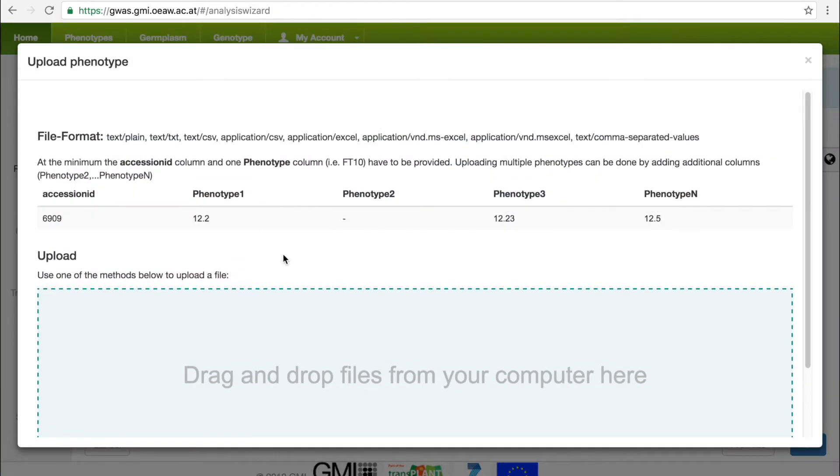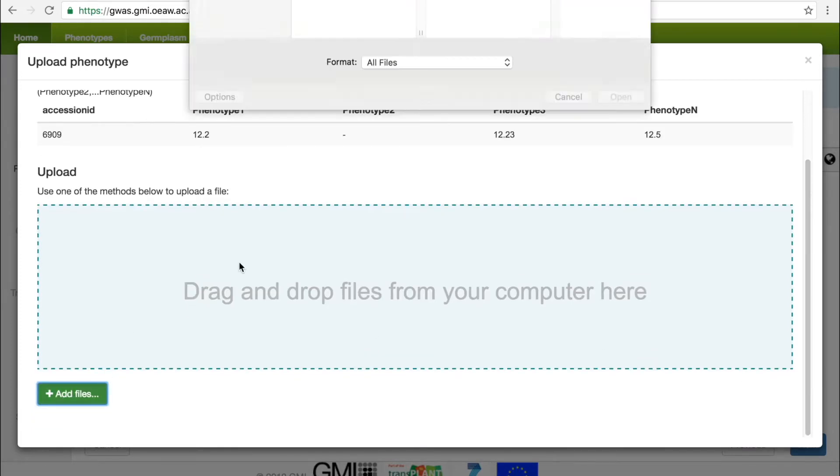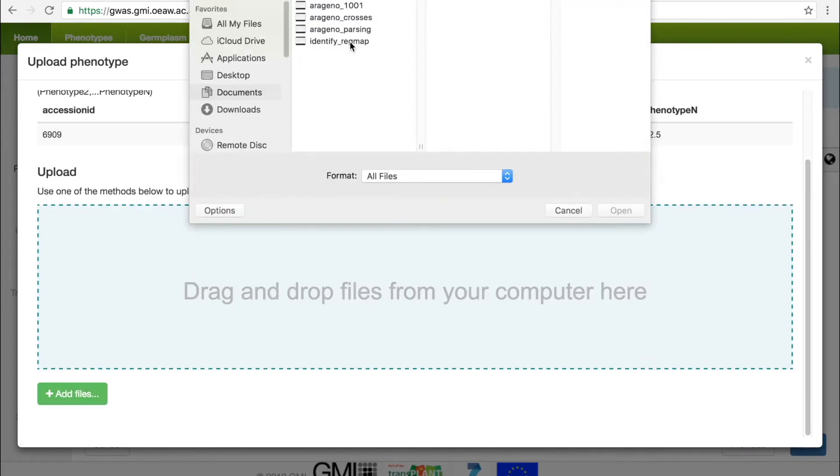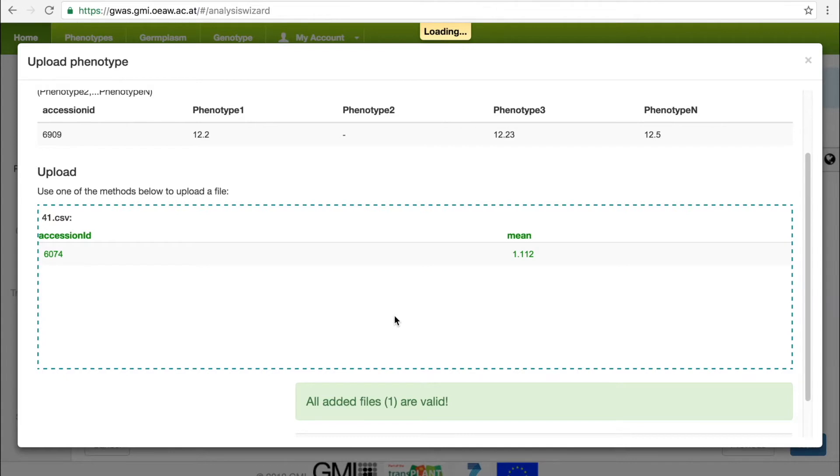The GWAS Portal provides a six-step wizard to make performing GWAS as easily as possible. After creating a study in the first step, the user must upload a phenotype as a simple comma-separated value file, where the first column is the accession ID and the remaining columns are the phenotype values.